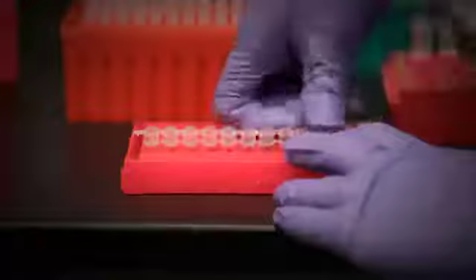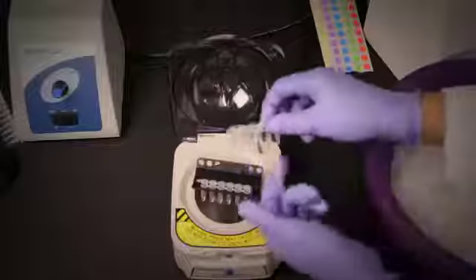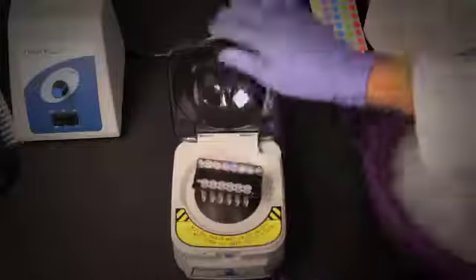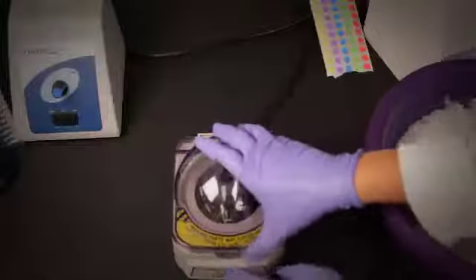After adding capture probe, put caps on the tubes, flick the tubes gently to mix the components in each one of the different tubes, and then spin it down briefly in the picofuge to collect everything to the bottom of the tube.